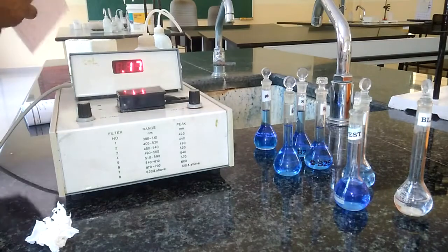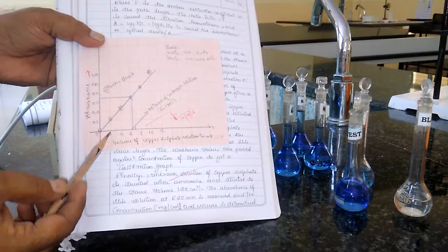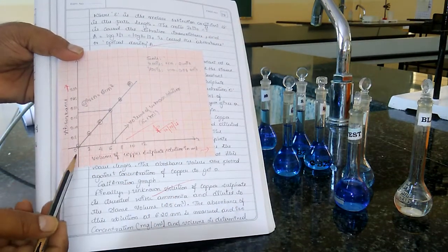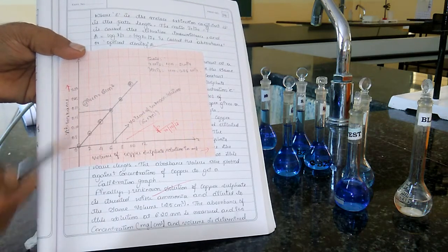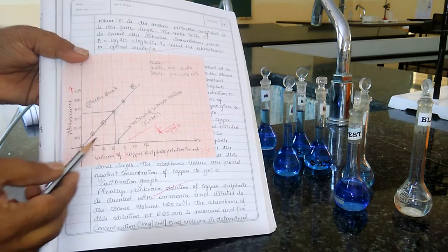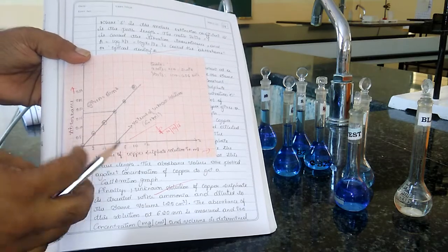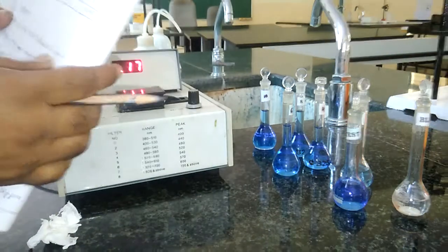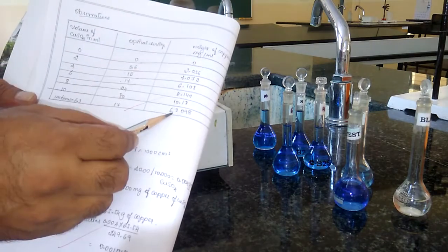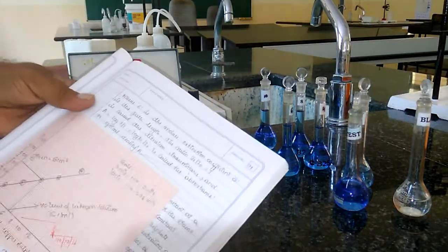Now, after all these readings, we have to plot a graph. The graph is plotted by taking the volume of copper sulfate on the x-axis — that is 2, 4, 6, 8, 10 — and the absorbance readings on the y-axis. We get a calibration curve passing through the origin. Using this calibration curve, we find the volume of the unknown copper sulfate solution, and from that volume, we multiply by 0.10 to get the weight of copper present in the unknown solution.